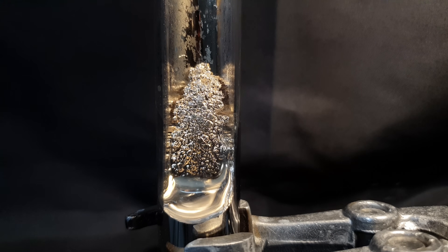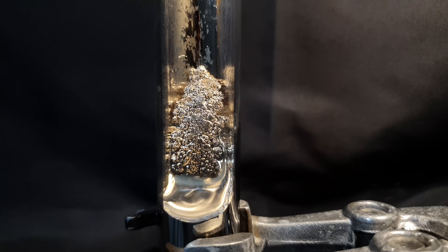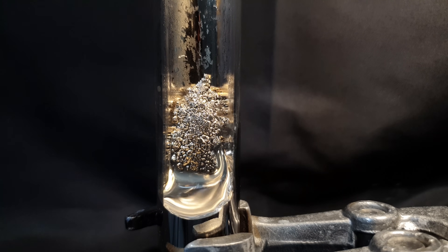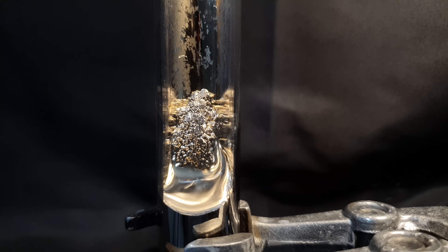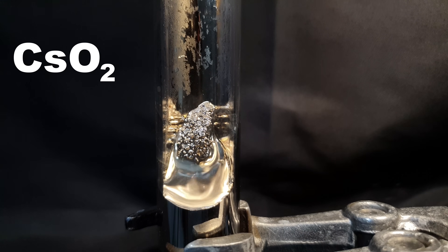Normally, the biggest issue when dealing with cesium is to keep oxygen away from it. In this video, I will be doing the exact opposite. I will use pure oxygen and let it react with cesium over a long period of time to produce cesium superoxide, also called cesium hyperoxide.